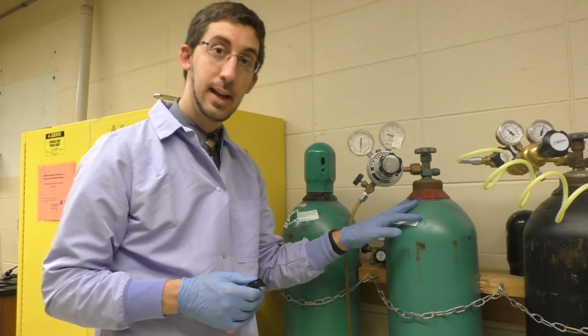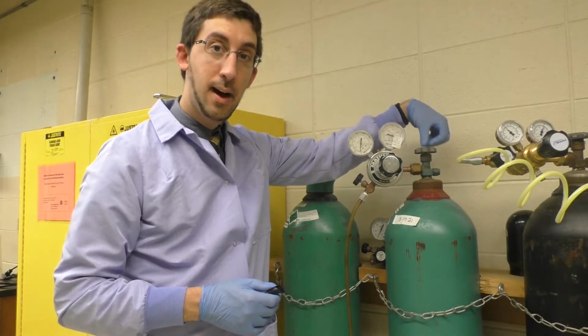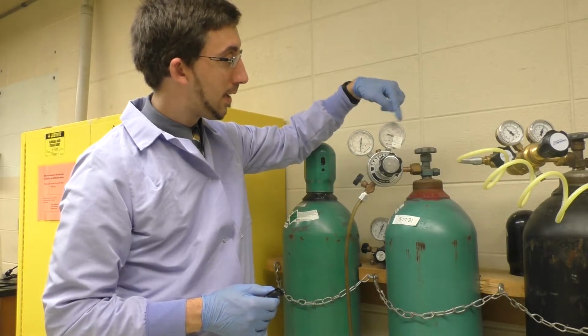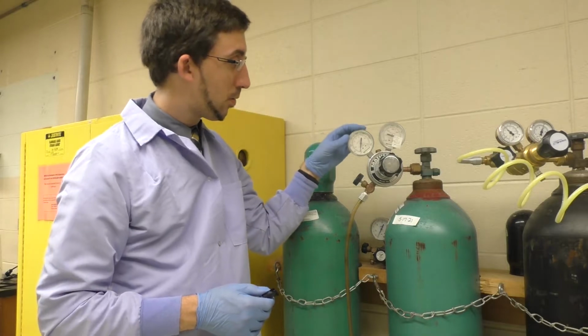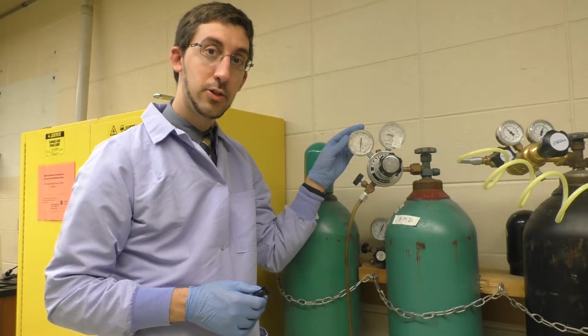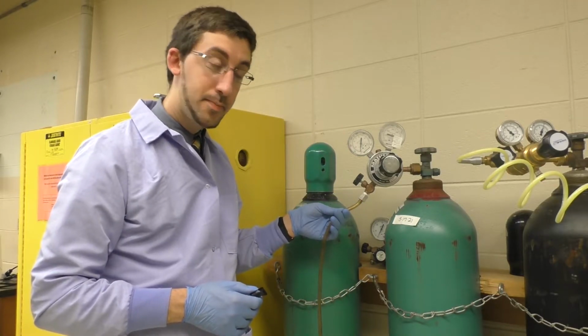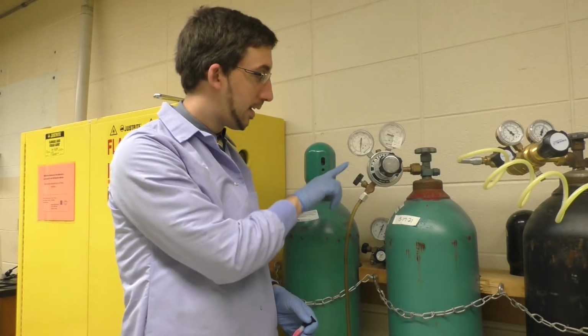We're here at the hydrogen tank. And I've already turned the tank on by opening this top valve here. You can see the pressure of hydrogen remaining in the tank on this dial right here. And then this dial right here will give me the hydrogen pressure coming out of the tube on this side. Now, I've got two other dials here. I've got a dial right in the middle and a dial on the side.